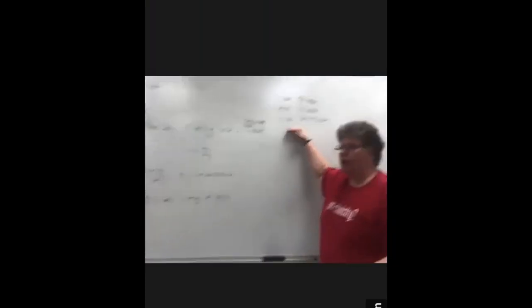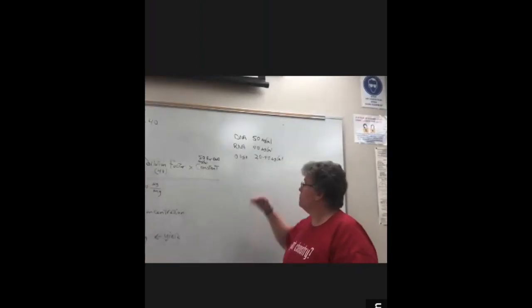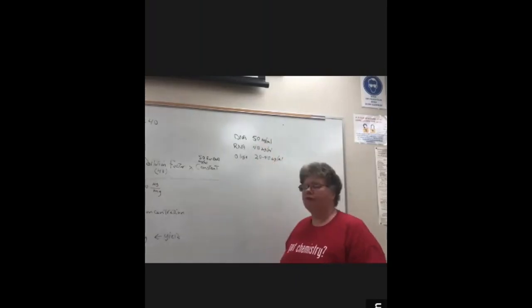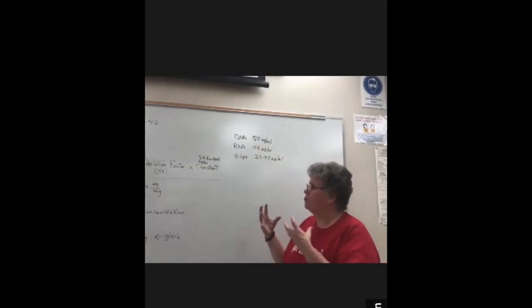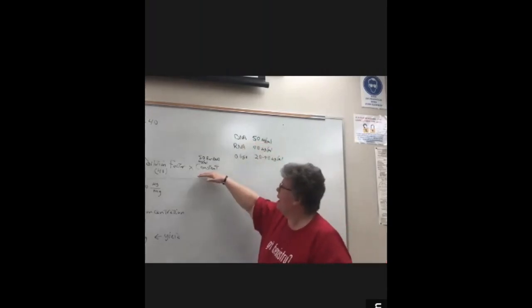So these numbers come from, you have one absorbance unit of DNA. One absorbance unit of DNA is a concentration, for example, of 50 micrograms per mL. So that's where that number comes from. It relates the absorbance to the concentration. So now you have units in here, but you now have it in micrograms.